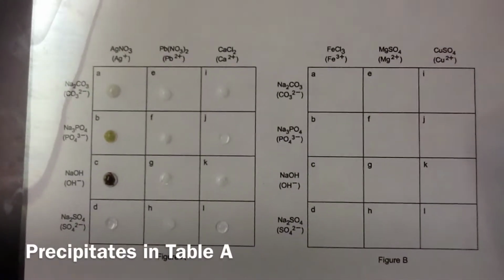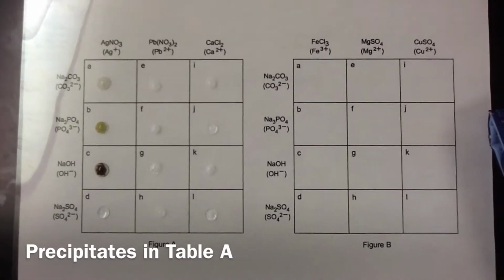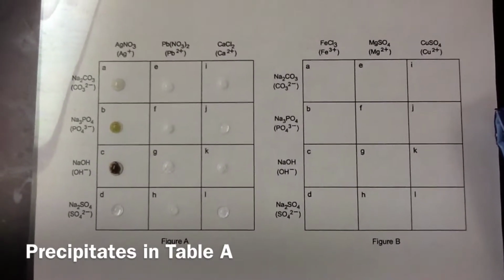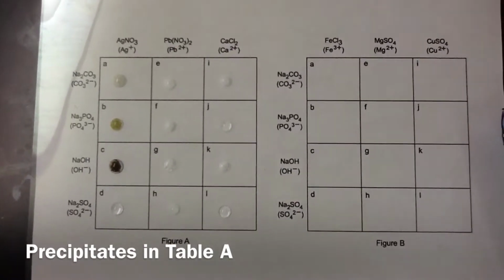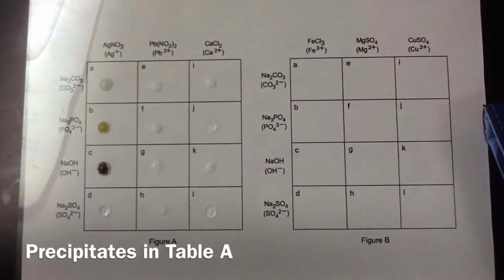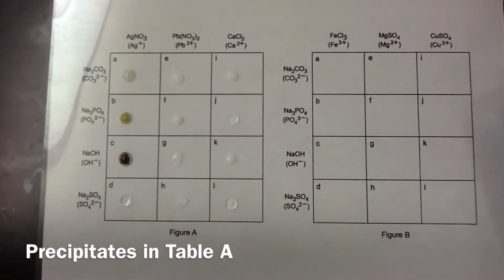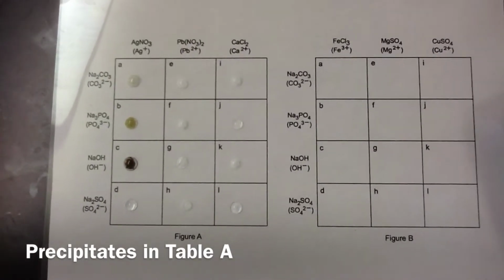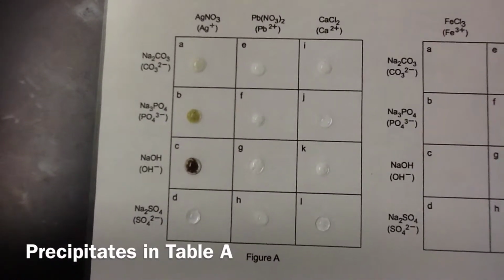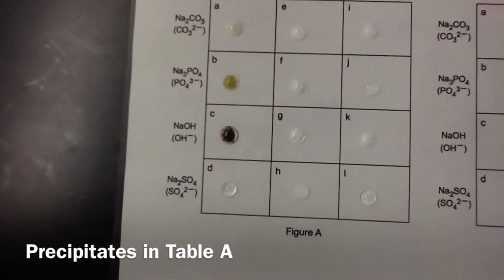The precipitates that formed were AgNO3 and Na2CO3; AgNO3 and Na3PO4; AgNO3 mixed with NaOH; PbNO3 mixed with Na2CO3; PbNO3 mixed with Na3PO4; PbNO3 mixed with NaOH; Na2SO4 mixed with PbNO3; CaCl2 mixed with Na2CO3; and CaCl2 mixed with NaOH. Those are our precipitates.